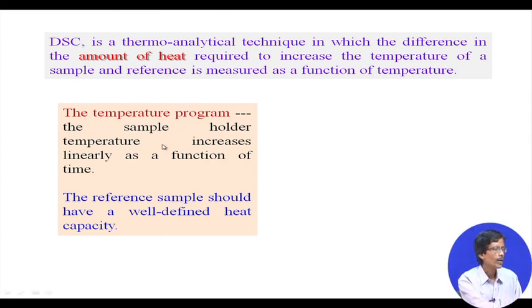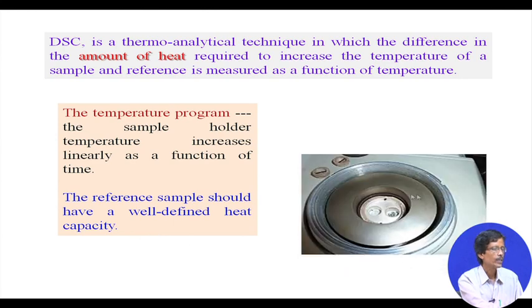So, the sample holder temperature increases linearly as a function of time, as we all know when we heat the thing, and the reference sample should have a well defined heat capacity. So, these are the two things that we can monitor within this particular thing.